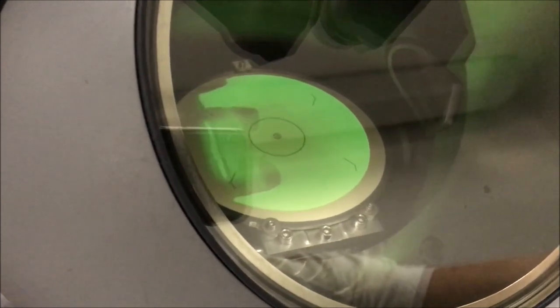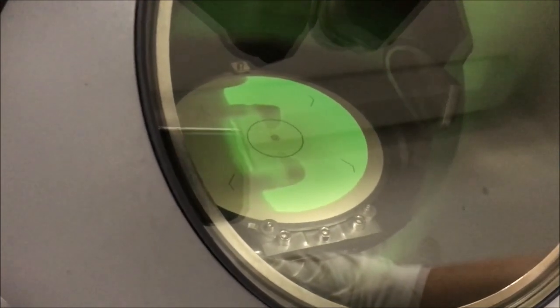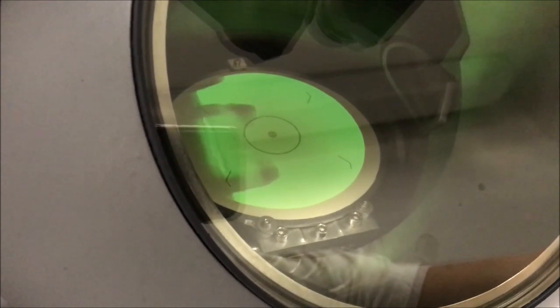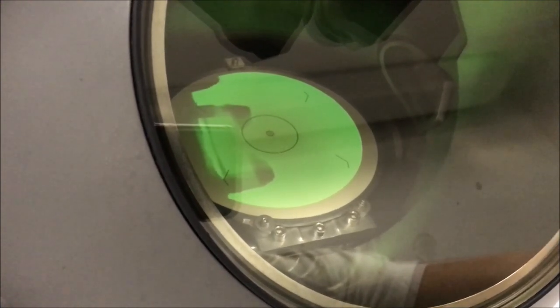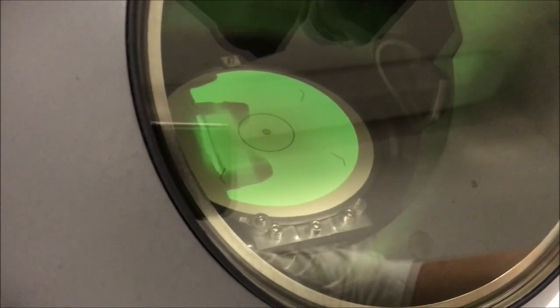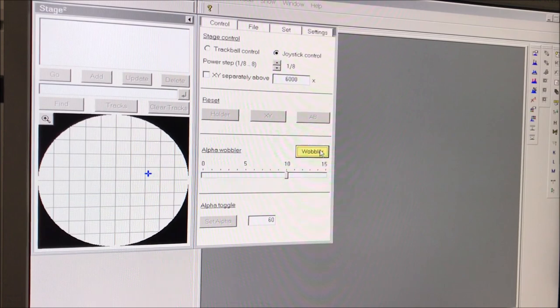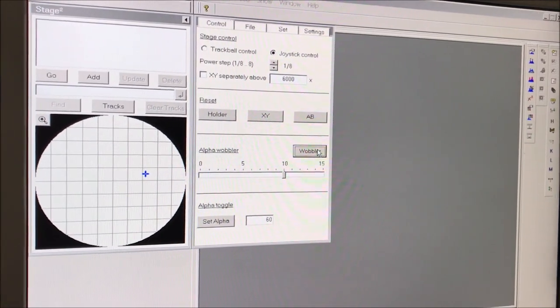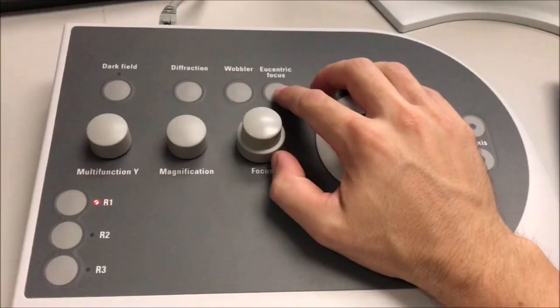It's helpful to do this at a fairly low magnification because at a high enough magnification you'll basically never see complete elimination of the shifting. Right now I was at an indicated mag of 13,500x. Once the shifting has been minimized, just come back and turn off the wobbler and you're done. That is truly the most rigorous way of setting eucentric height on your TEM.